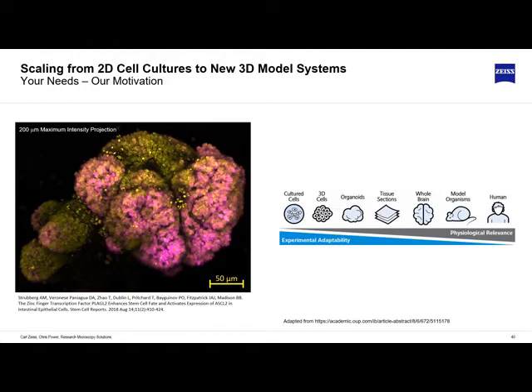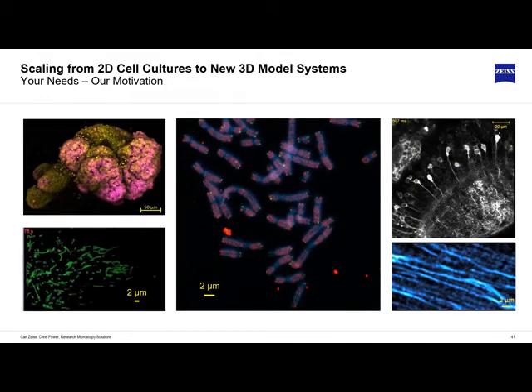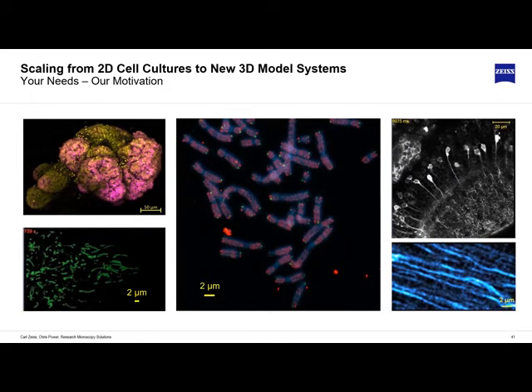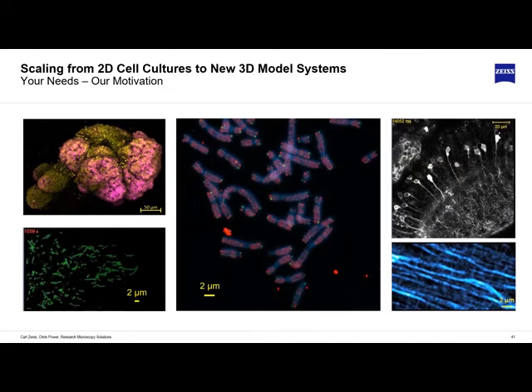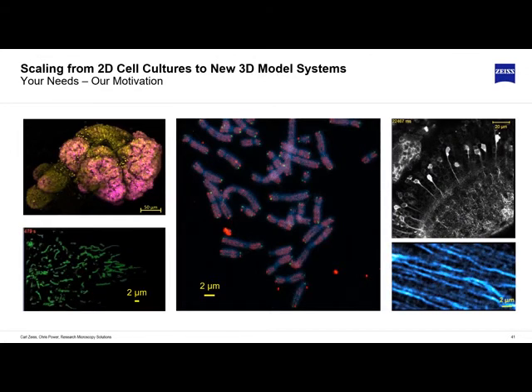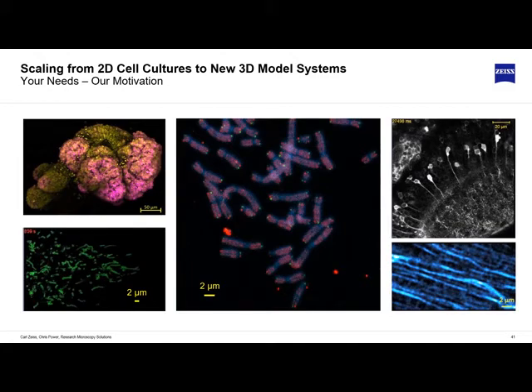Now, this is a point where I always find it interesting in PowerPoints, because of course, when I put an image up, we try and put it big enough that you can see the image, but without a scale bar, you kind of lose context here. This slide I'm showing you shows a handful of images that we've shown over the past few years in talks, and of course they all look nice, they all look lovely in their own right.